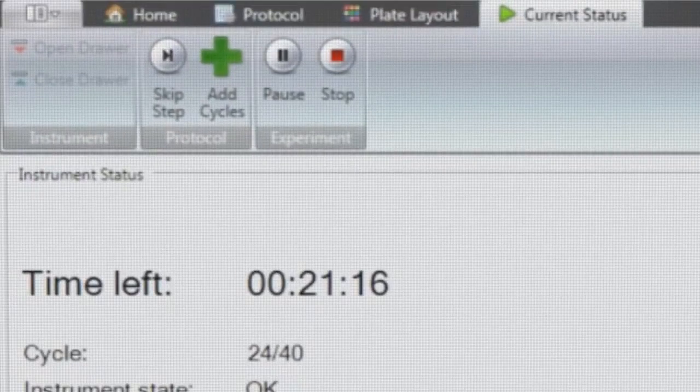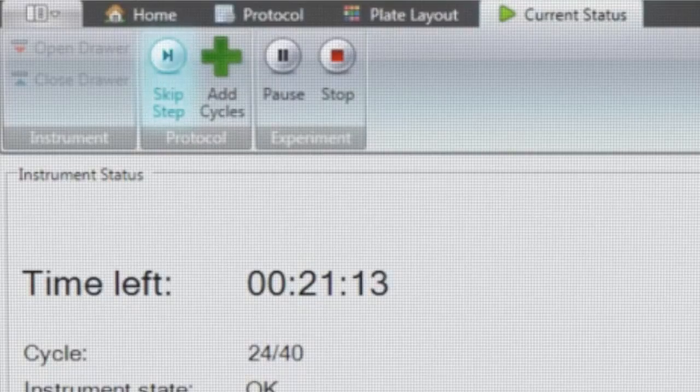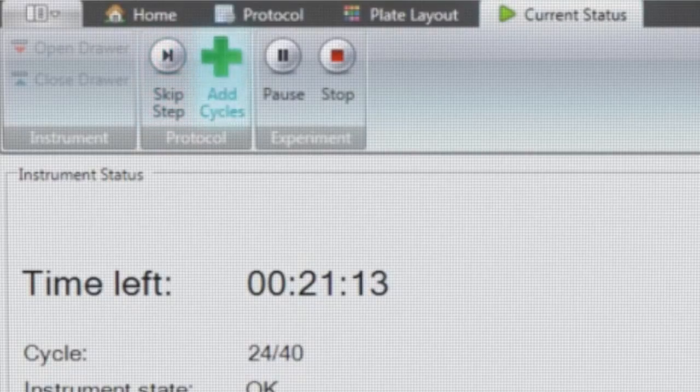During the run, there is the possibility to skip a protocol step, add cycles and pause or stop the protocol if required.